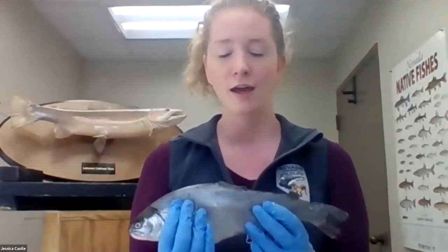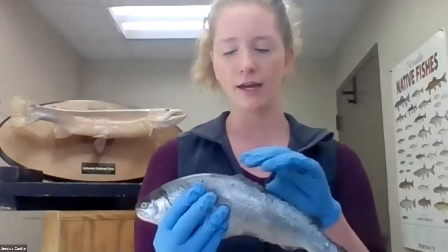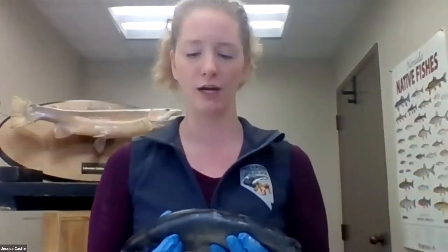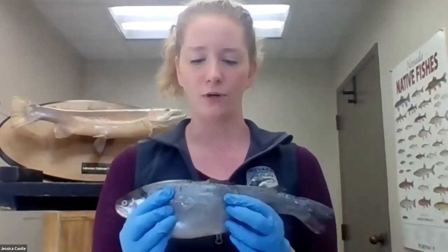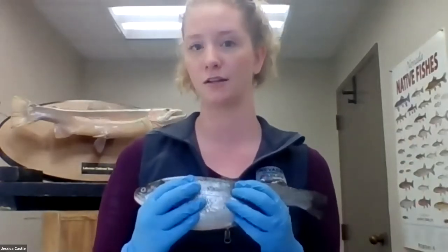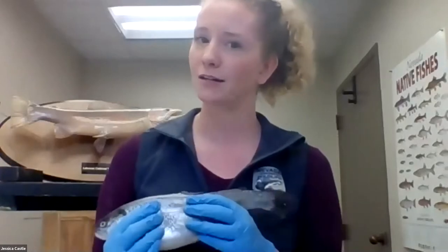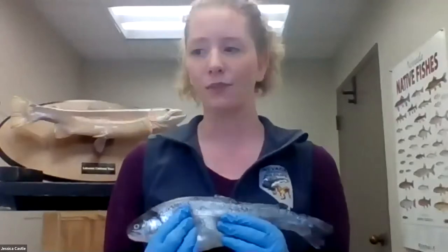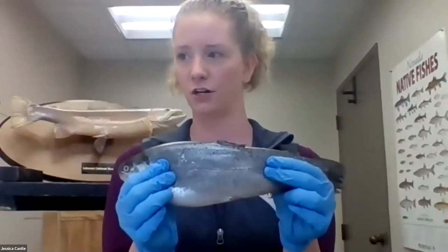Let's start with the outside of the trout. On the outside, we have scales covering this trout. We are going to be using the chat throughout today's program because I want to hear from you about what you think you're looking at and what exactly the function of each one of these different body parts is. Go ahead and open up your chat and put in what you think the function of the scales on a trout are.